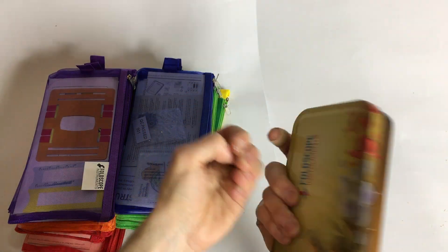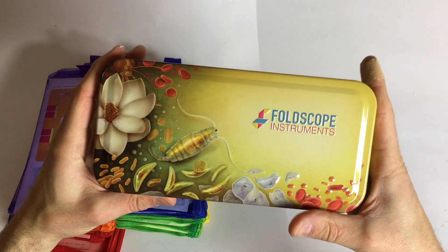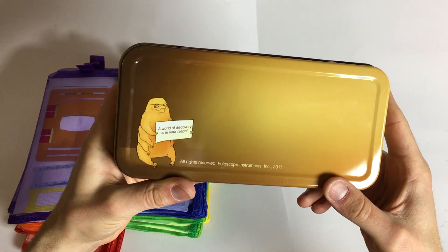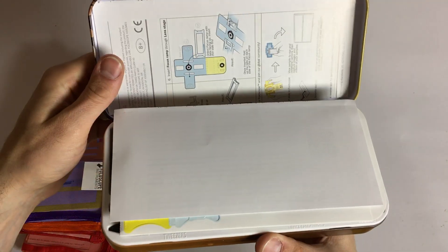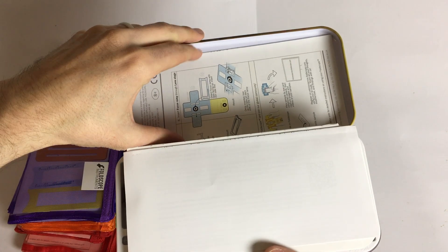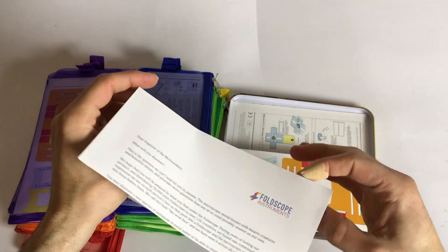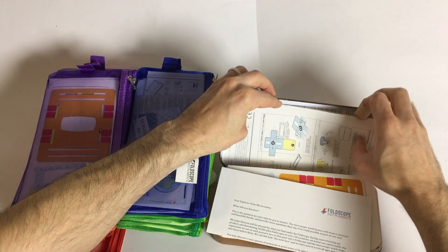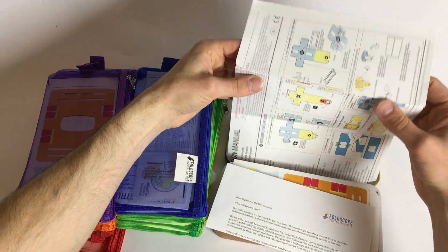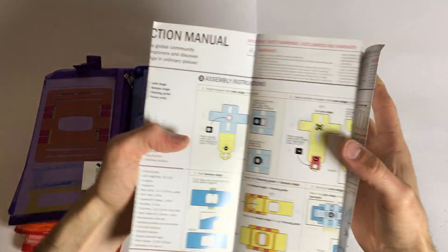Because you can look at blood and analyze stuff with this — so they claimed. Nice. Foldscope instrument with the origami pattern, tiny tiny stuff you can analyze with it. A world of discovery is within reach. I waited for this like half a year, since I backed the Kickstarter. Manu Prakash — that's his name. He has some other cool ideas to be backed soon. Instruction manual.